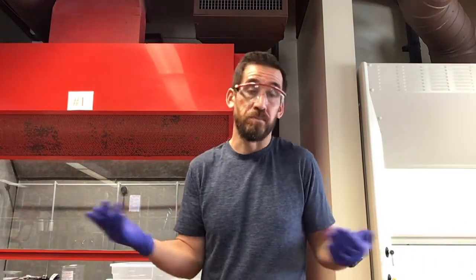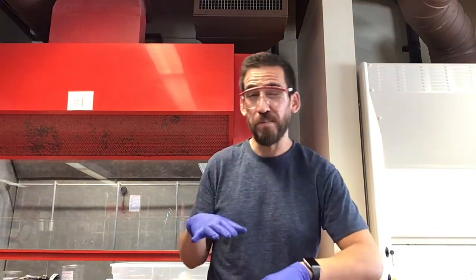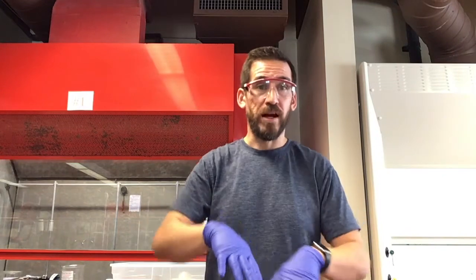If you don't remember the general rates of reactivity, it's really important that you do. And then hopefully we observed that trend here in the lab. If not, maybe I made an error, maybe not, maybe you're not thinking about it right, maybe, right? Think about it. Super fun stuff.